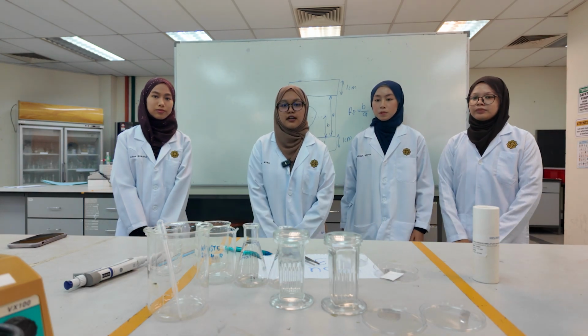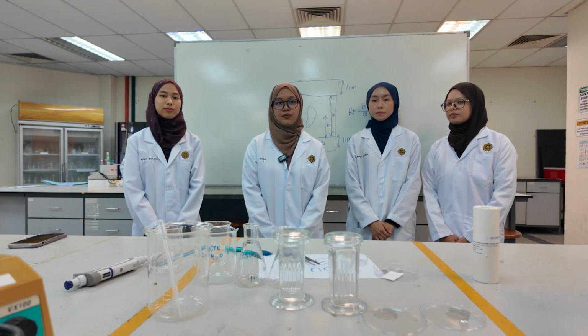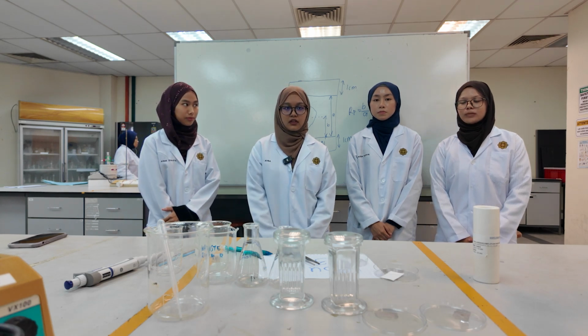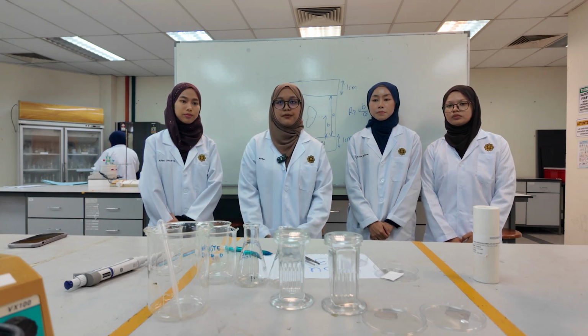Hi, my name is Nurkhalisa binti Azizan, and I will present to you about applications of thin layer chromatography in industry. First is the pharmaceutical industry. One of the main applications of TLC in the pharmaceutical industry is purity testing.